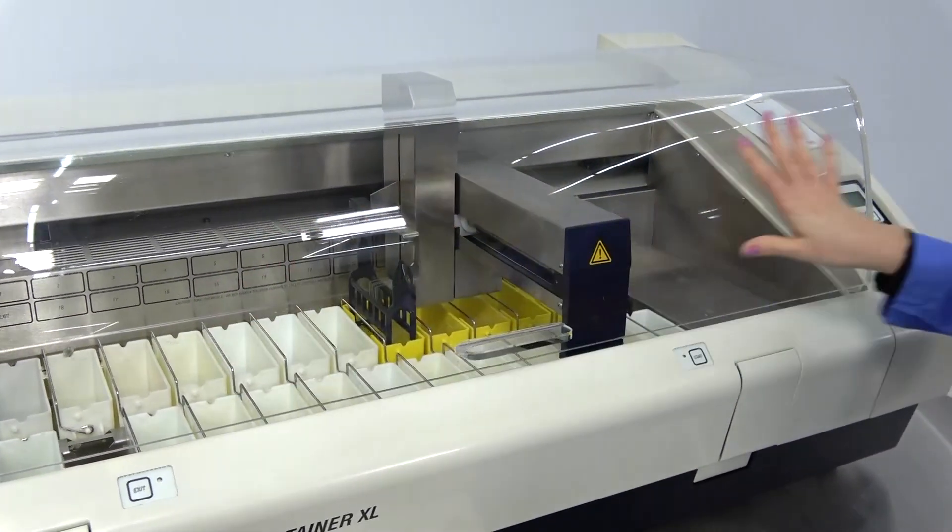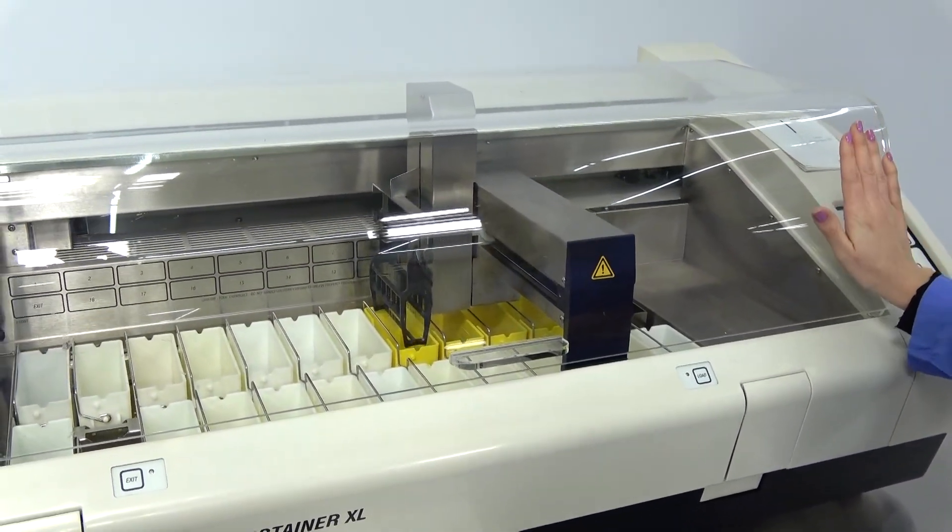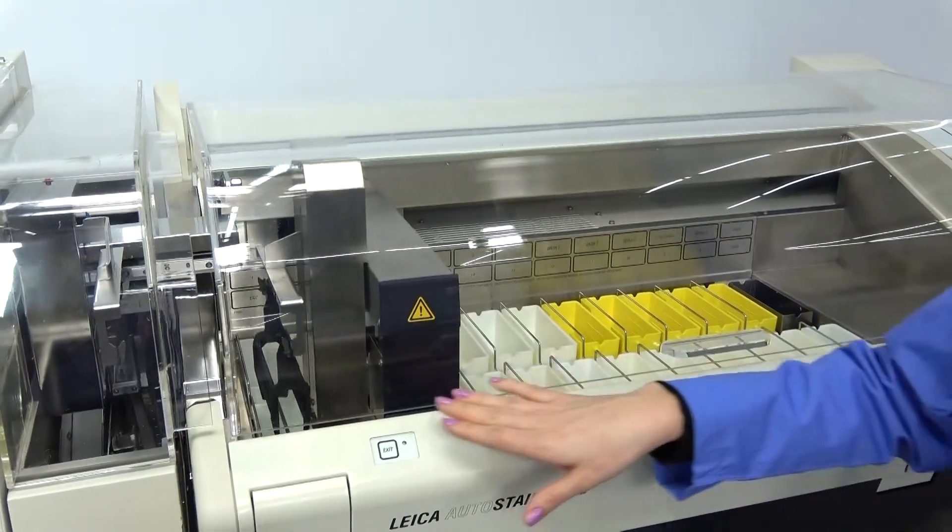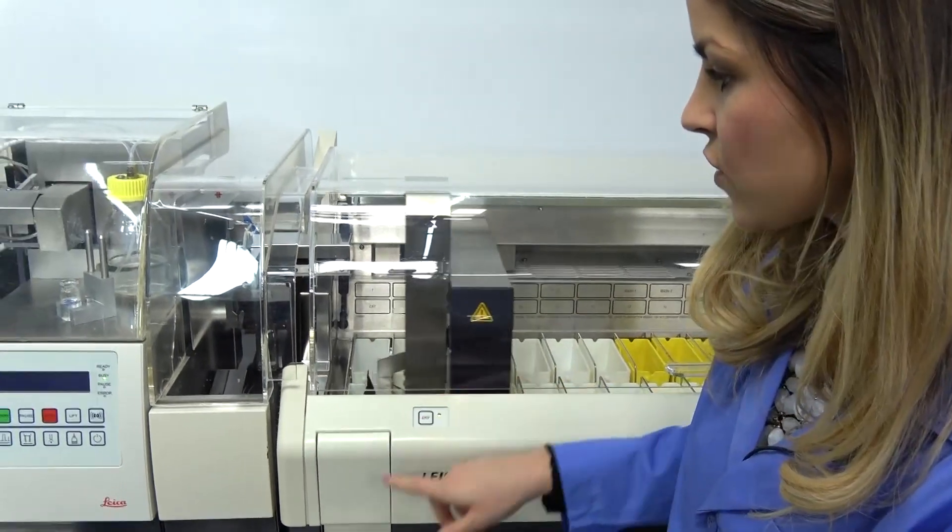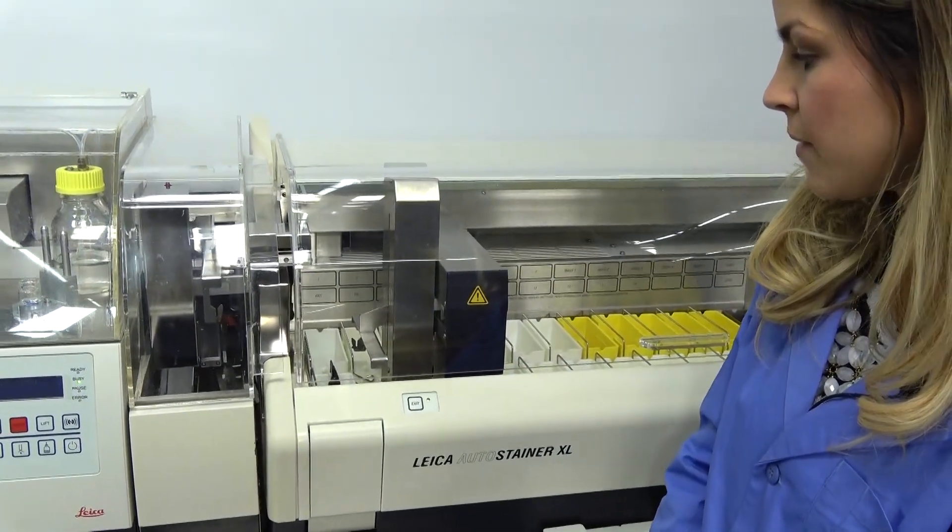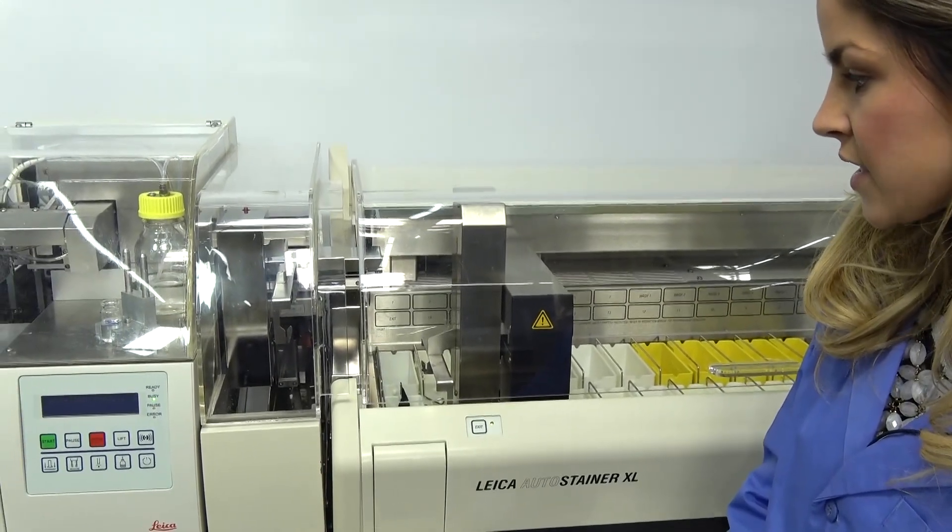There's no visible scratching on the outside of this hood either. It's going to drop the basket at the exit position here, and when it does that, it's going to initialize the cover slipper to pick up the basket and start the cover slipping application.